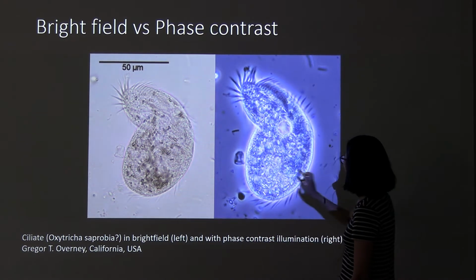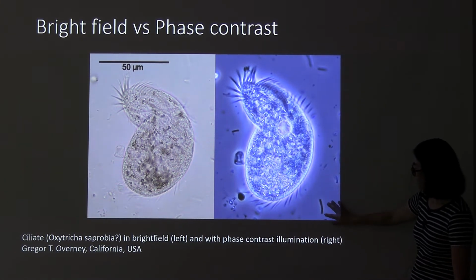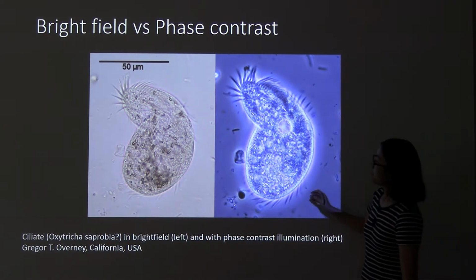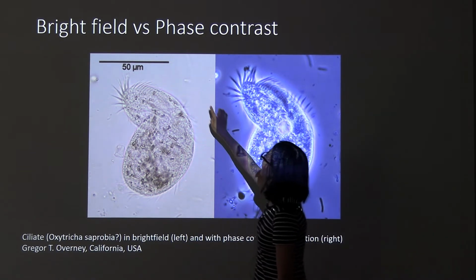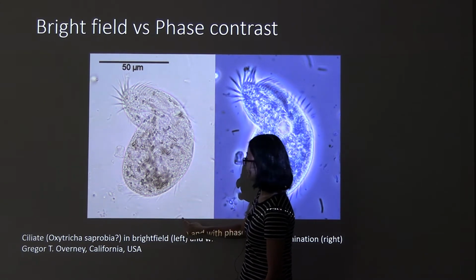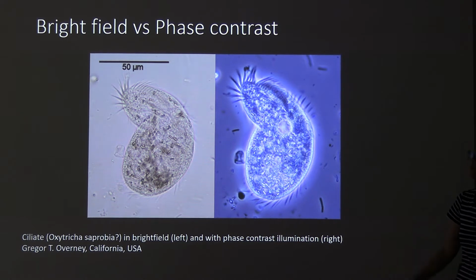You can see they are black under this phase contrast microscope. But when you try to find this kind of bacteria under the bright field microscope, it's hardly seen. So probably here and here, but you couldn't really see the shapes or more detail.